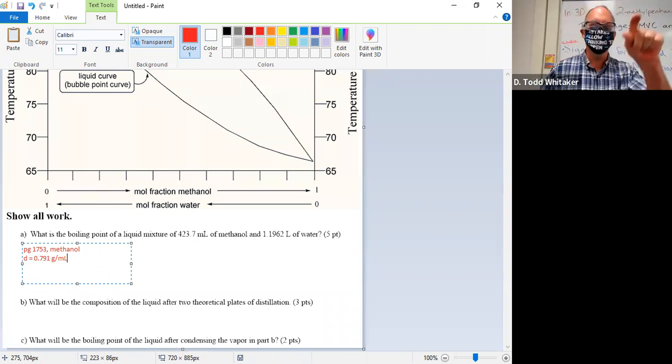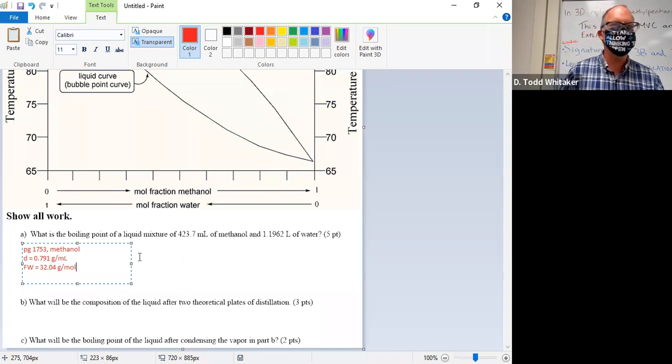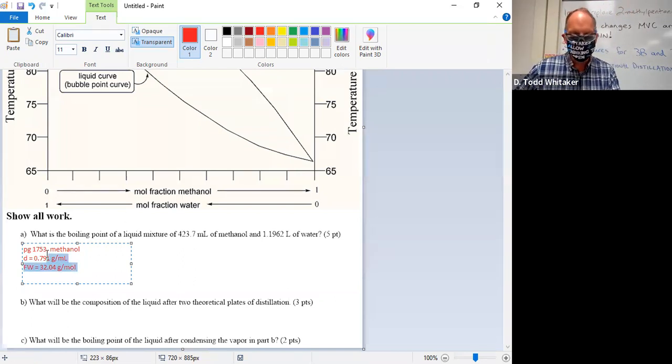cc. Okay. I need the formula weight or the molecular weight. They are indeed the same thing. I believe Aldrich likes to call it formula weight, don't they? Correct me if I'm wrong. Does it say MW or FW? Neither? FW, what's the number? 32.04. What are the units for molecular weight or formula weight? That's the proper one we use for real life practical chemistry. Grams per mole.